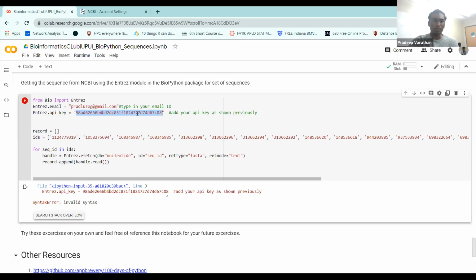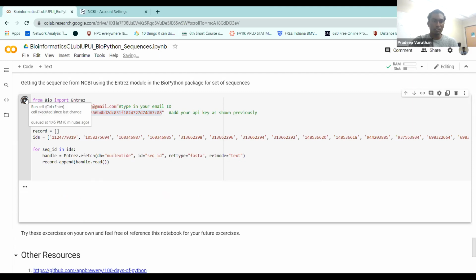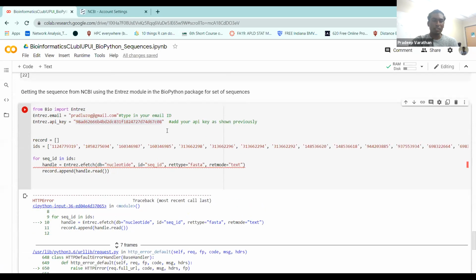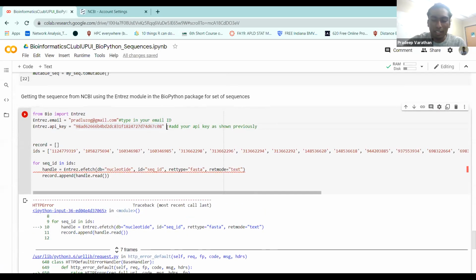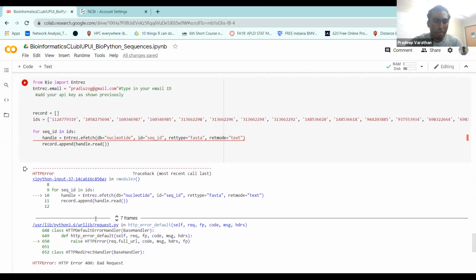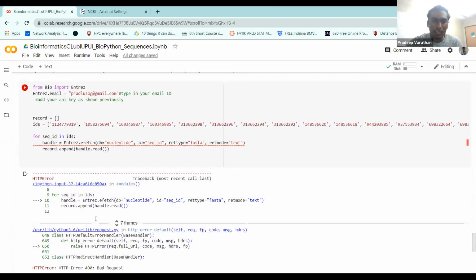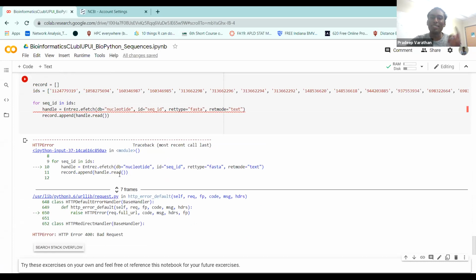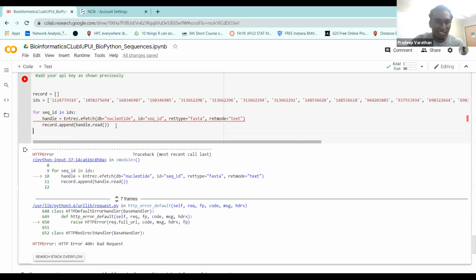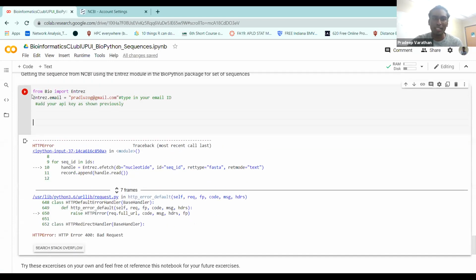Oops, what happened here? All right, I think my code isn't working here. Scratch that. I think we'll go back to this part of the code in the next lecture series because there's some sort of error in the end. I'll look it up again and we will come back to it in the next lecture series.